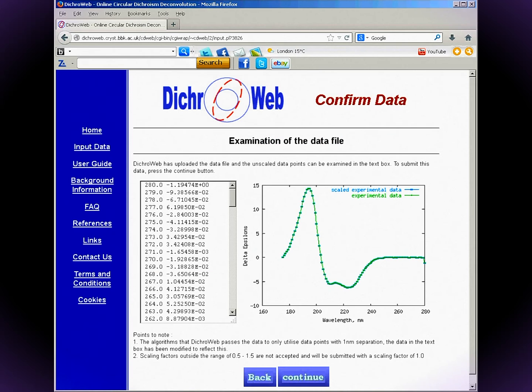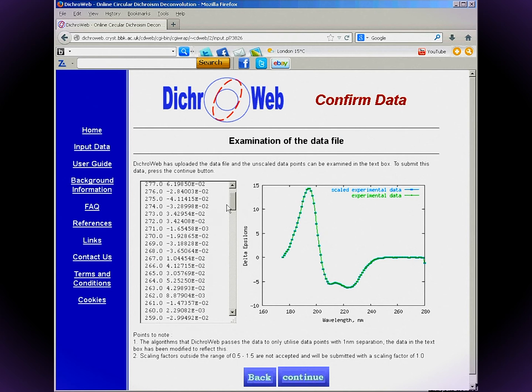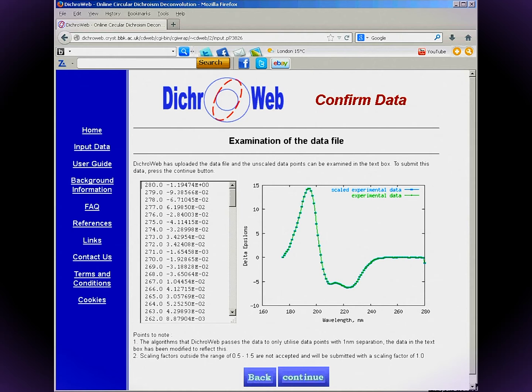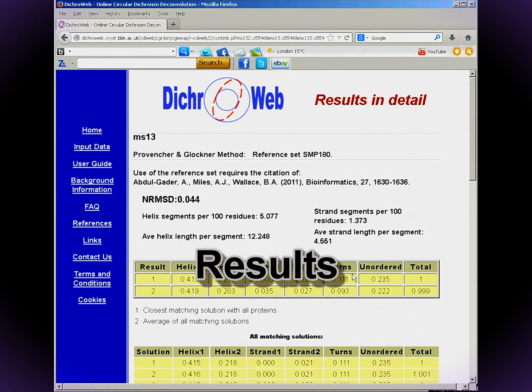The next page verifies your input — click Continue. This page shows the spectrum in the output units of your choice. You can verify that DichraWeb is reading it correctly and that the spectrum is of the right order of magnitude. This is why you should choose delta epsilon or mean residue ellipticity as output. Continue and show extended results.